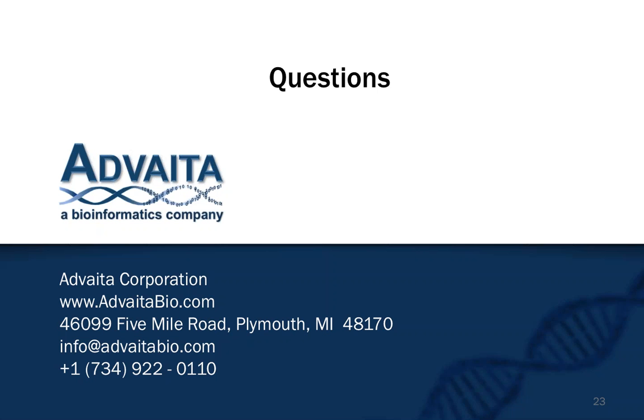We find that it still delivers really good results because it's conservatively curated, but we do have it in our books. As soon as our beta for our variant application comes out, we will be looking at adding Reactome pathways, and also have the ability to possibly do network analysis based on those different databases.